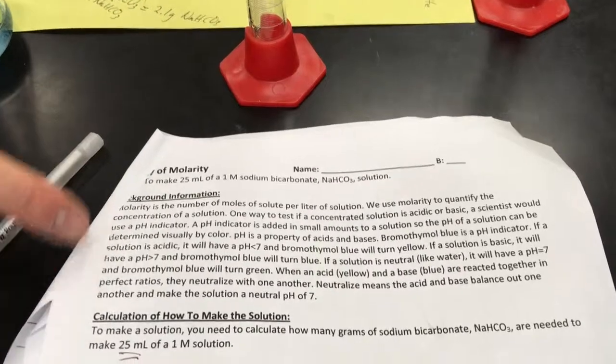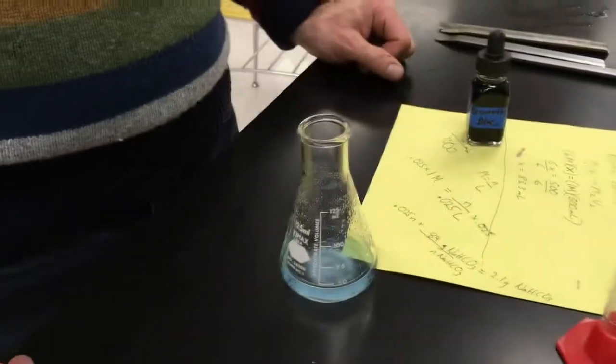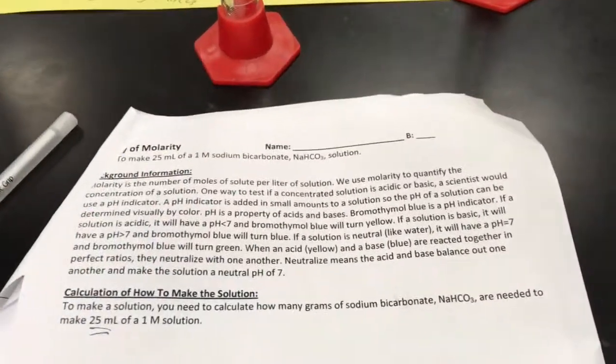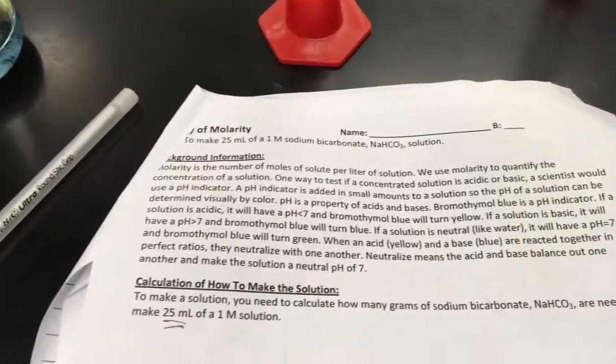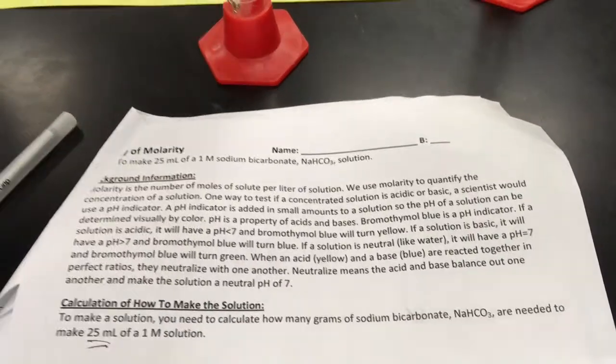If it's acidic, it has a pH less than 7 and it'll be yellow, but our solution is blue, so that means it is basic. Okay, blue. So we want to neutralize it, make it like water, have a pH of 7, and we want it to turn green. So when an acid and a base come together, they should neutralize one another.